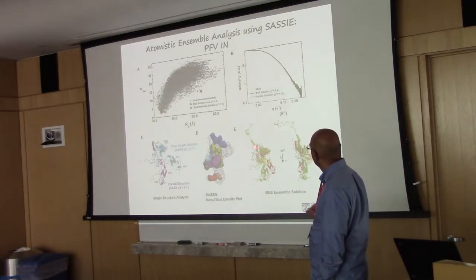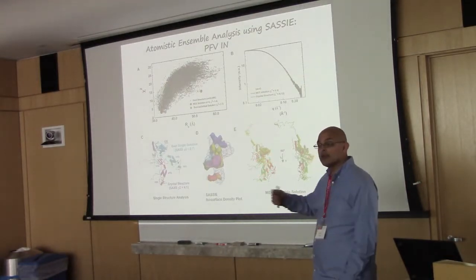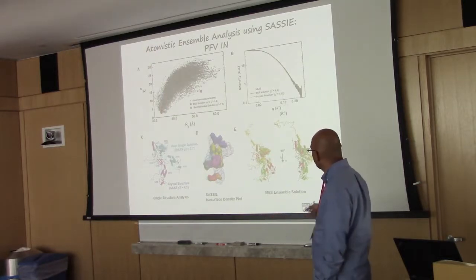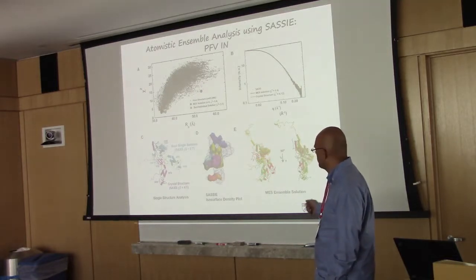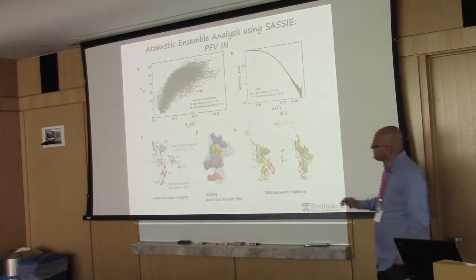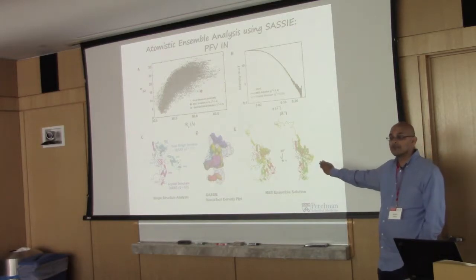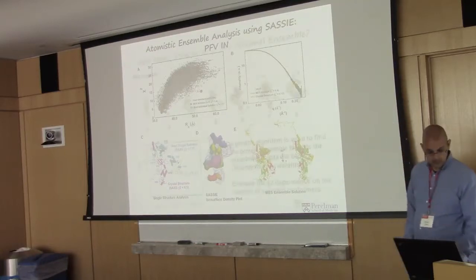If you overlay them, you might have one outlier that together did a better job of describing the experimental data. So generally, this provides a comment that you're not looking at really dramatic conformational changes necessarily, but basically changes relative to the catalytic core domain here. Everything is plotted aligned relative to one domain. This is one way you can treat this. There are many other variations on this with regards to atomistic model. This gives you an illustration of what you can do.